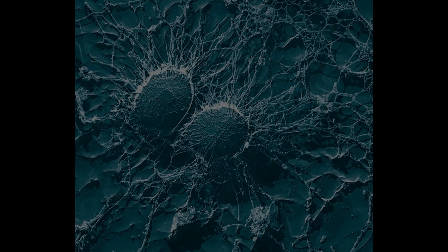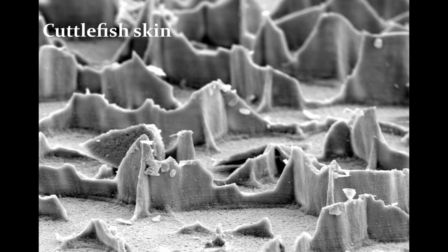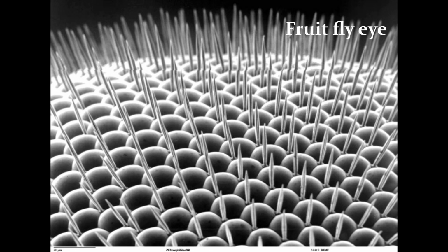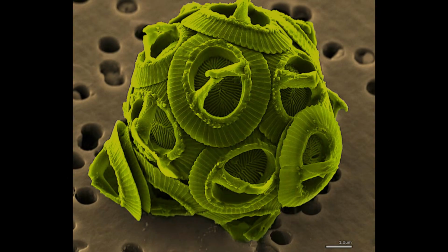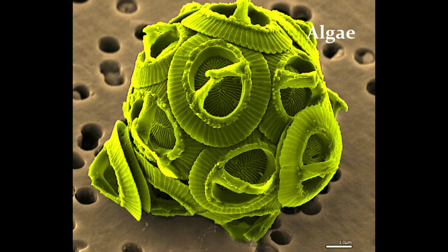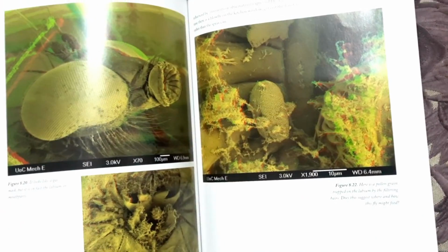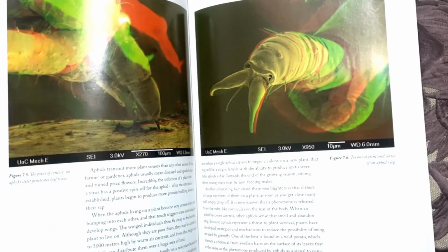With scanning electron microscopy, as you can hear from the name, you can scan the surface and create a topography of the objects. Therefore, we can use it for things like small animals and insects. You can see the eye of a fly or some bugs. We can see things like cells and viruses in 3D. Many people even create 3D images by photographing the same field from different angles and creating a beautiful 3D image you can see with special 3D glasses.